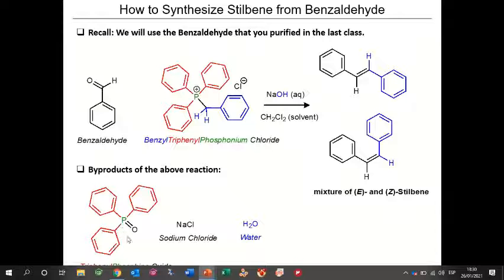And also you are going to get byproducts of the reaction, which you can see over here: sodium chloride and water.